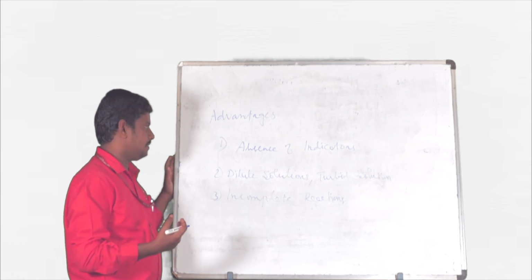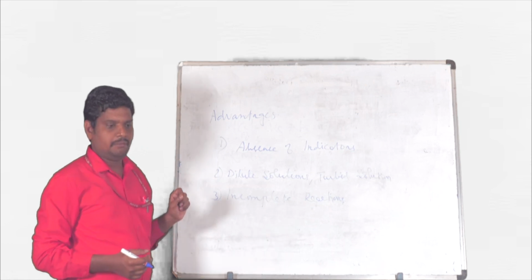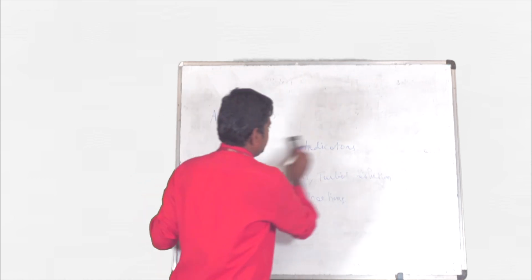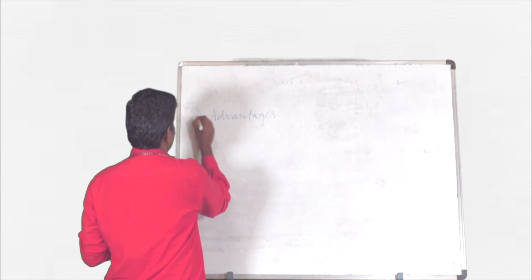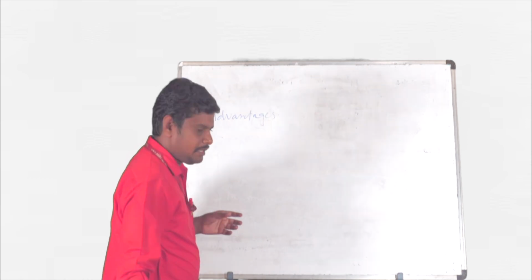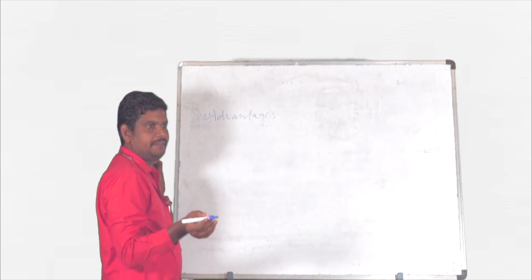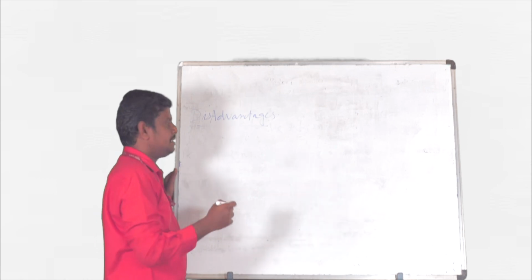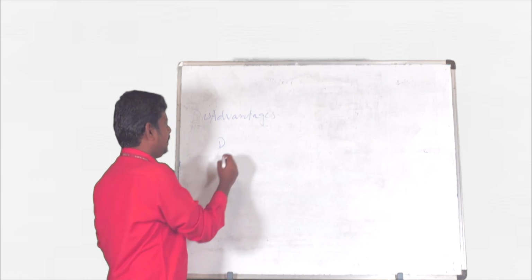The advantages of conductometric titration are so many. We are pointing out a few, but it is associated with some disadvantages also. So, what are the disadvantages? If any foreign electrolyte other than the electrolyte of interest is present, we could not identify the endpoint accurately.